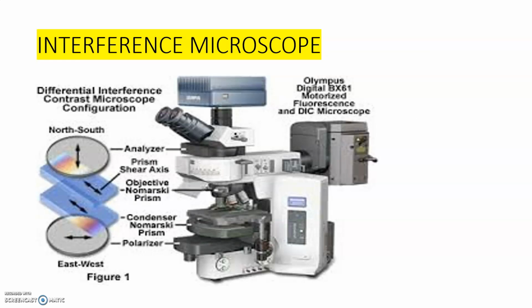Now next is interference microscopy. It can be differential interference contrast microscopy. Here we have given the differential interference contrast microscope configuration.